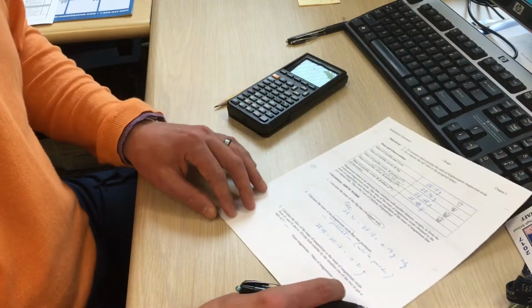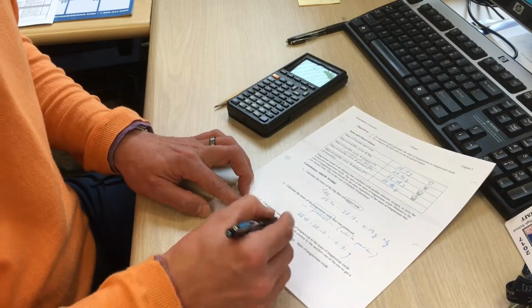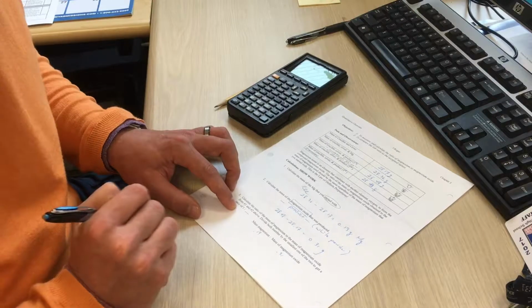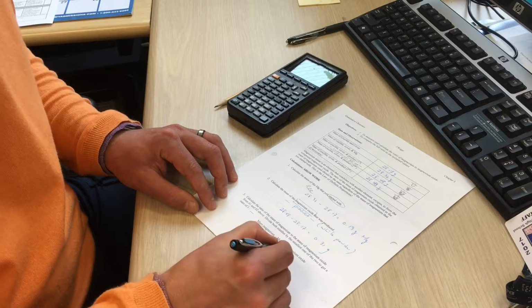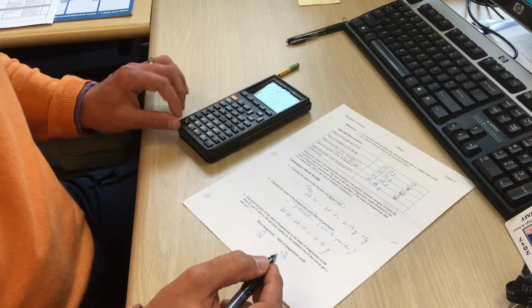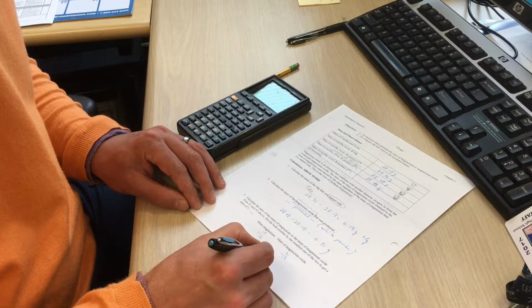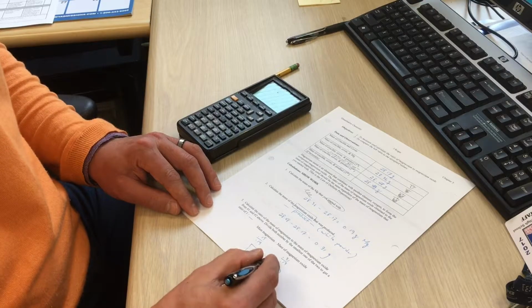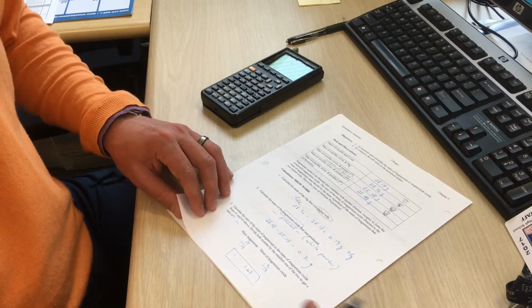What we have to do here is the ratio of the magnesium to the magnesium oxide. Magnesium was 0.19, and our magnesium oxide is 0.31. We can divide them both by the smaller number so that we have a ratio that is 1 to something. So 31 over 19 is 1.63. If we want to have this ratio as a percentage, we're going to do just like we did in the activity and on the worksheet.